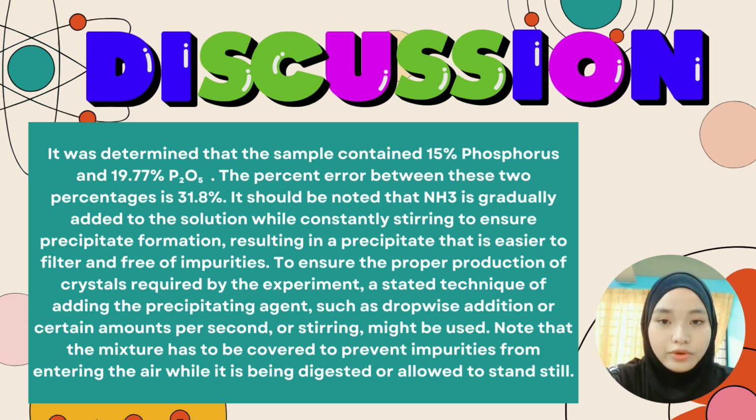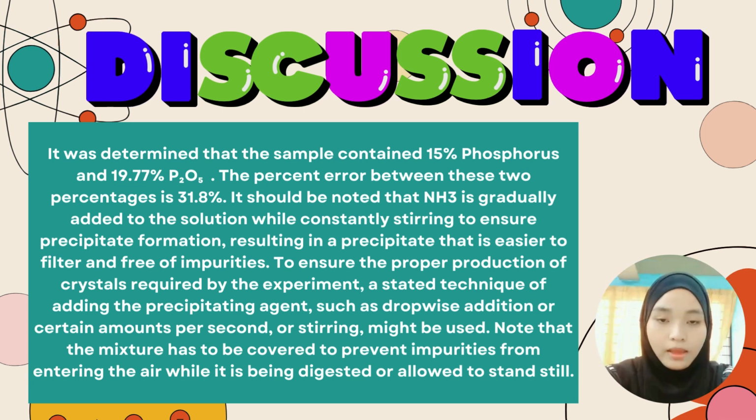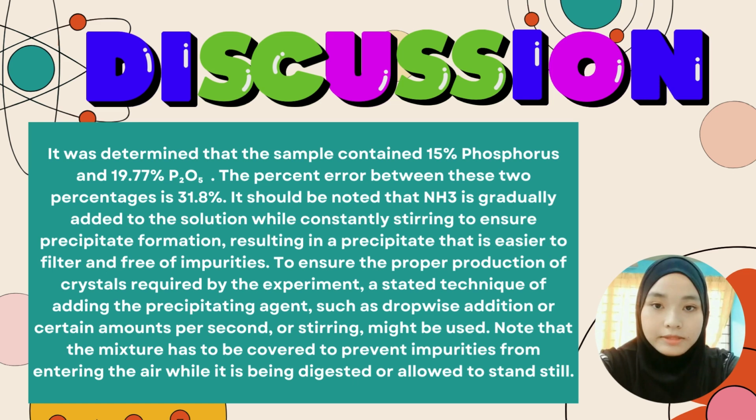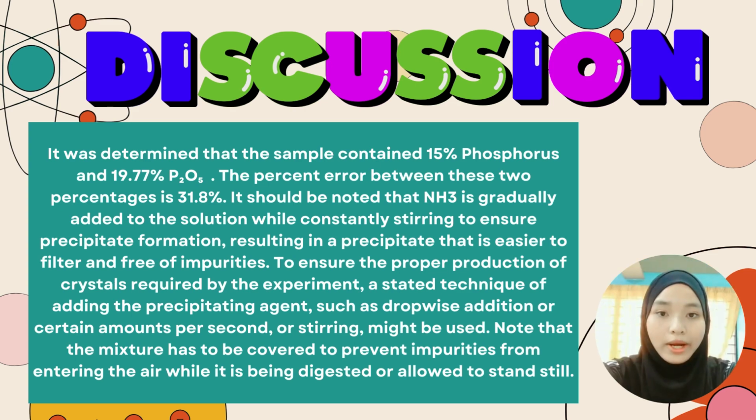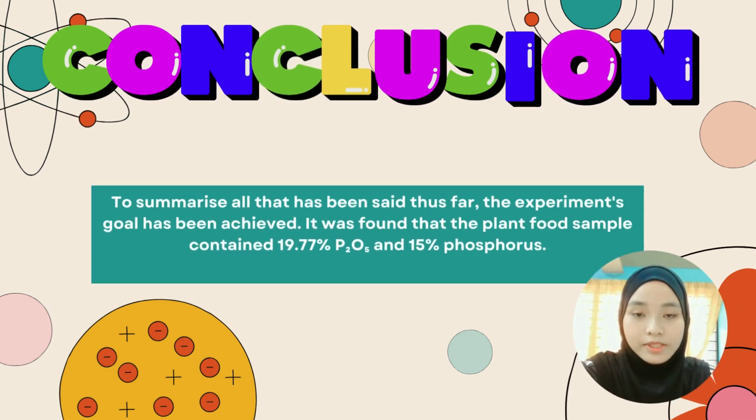Ammonia is gradually added to the solution while constantly stirring to ensure proper formation of the precipitate, resulting in a precipitate that is easy to filter and free of impurities. To ensure the proper production of crystals required by the experiment, a technique of adding the precipitating agent, such as dropwise additions or a certain amount per second, or stirring might be used. The mixture has to be covered to prevent impurities from entering the air while it is being digested or allowed to stand still. To summarize all that has been said thus far, the experiment's goals have been achieved.